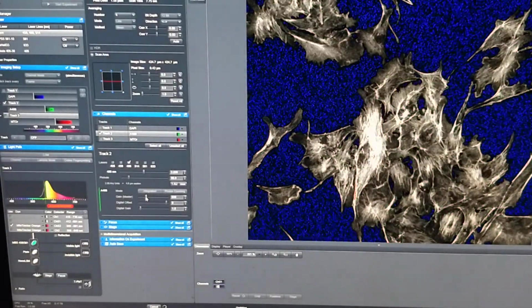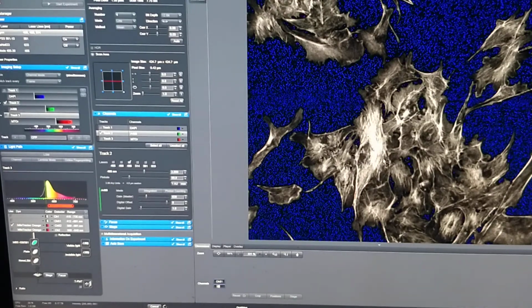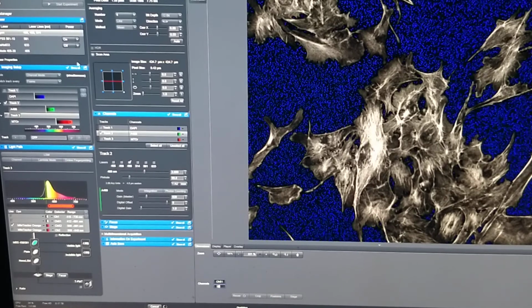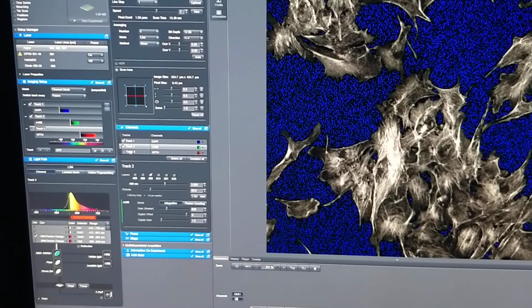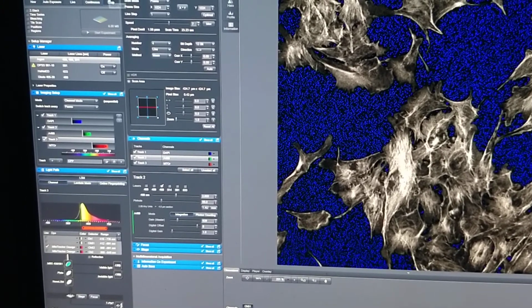Okay, so almost to here. Okay, so that we don't have much red pixel here. So now this is good. Then we click on stop, and then we click on all three of them, and then we click on snap again.